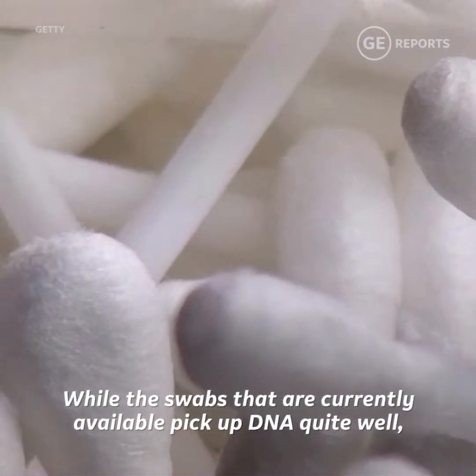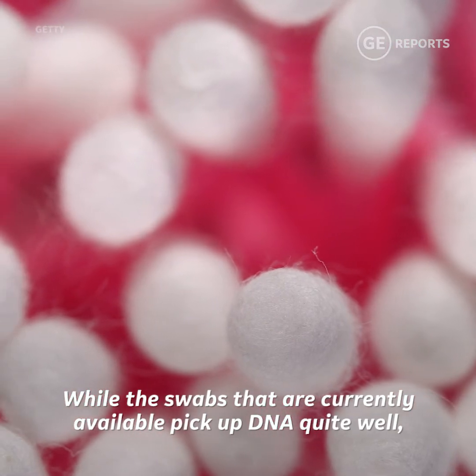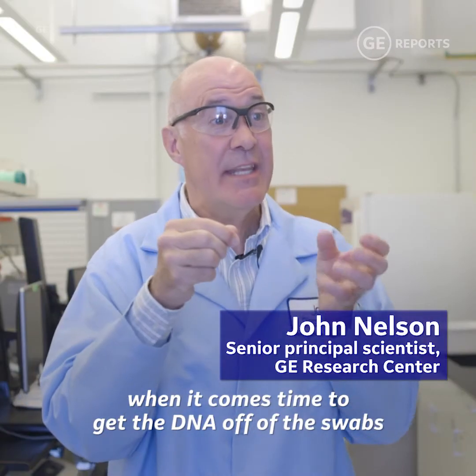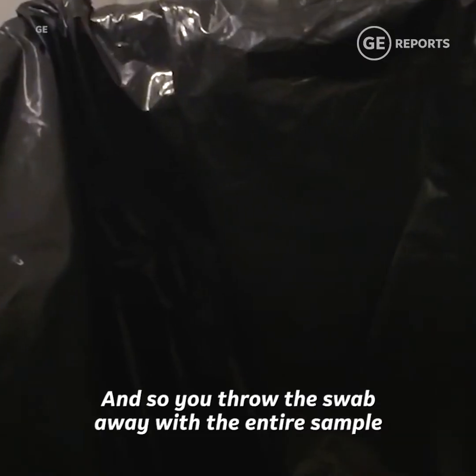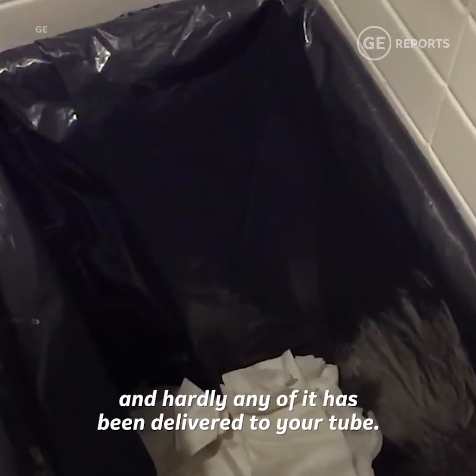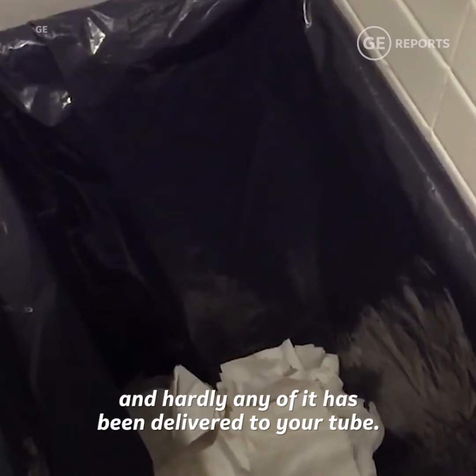While the swabs that are currently available pick up DNA quite well, when it comes time to get the DNA off of the swabs, it doesn't let go. And so you throw the swab away with the entire sample, and hardly any of it has been delivered to you.